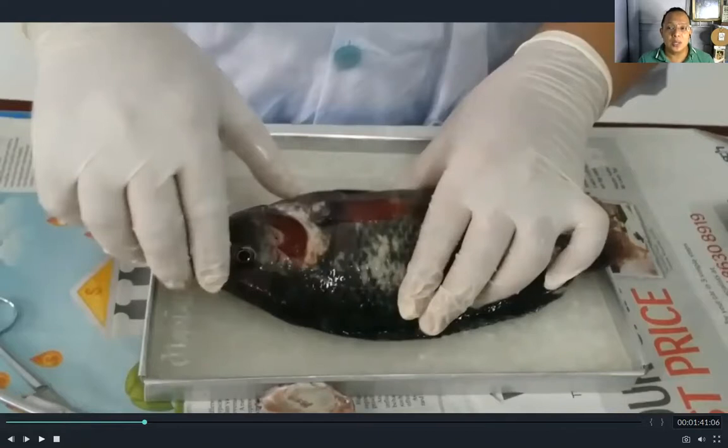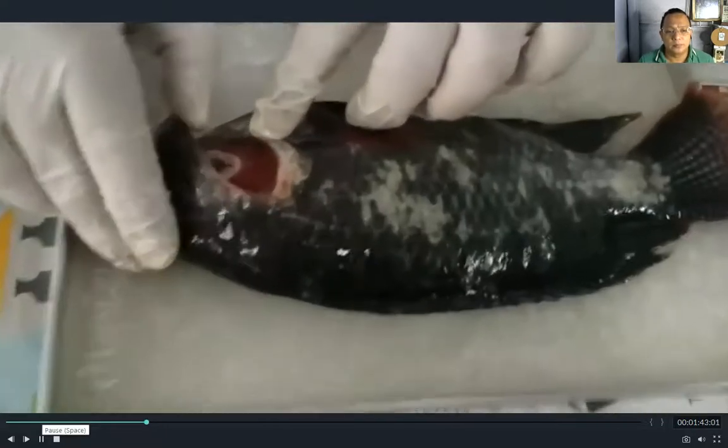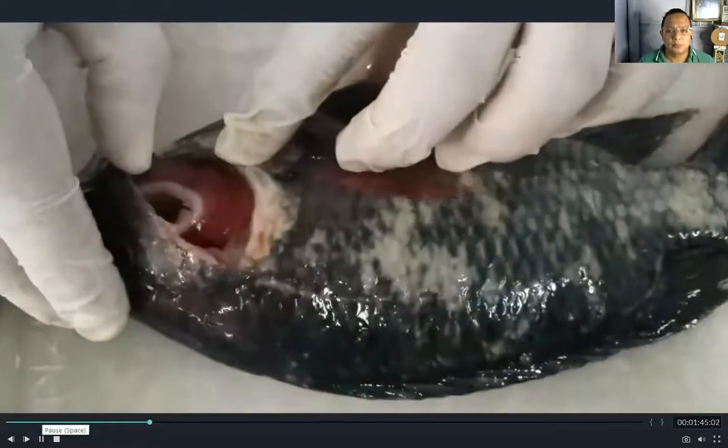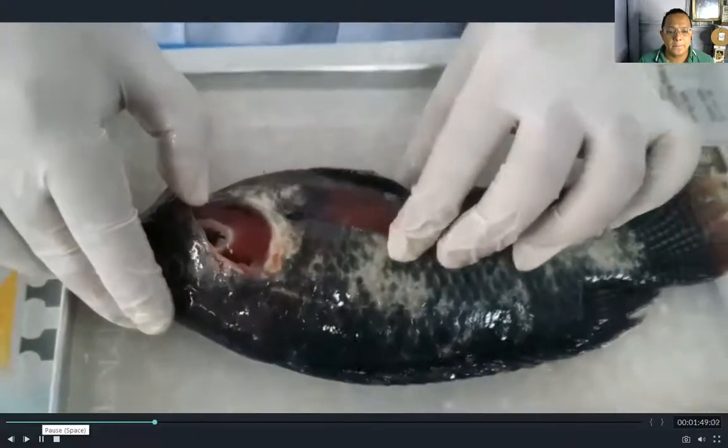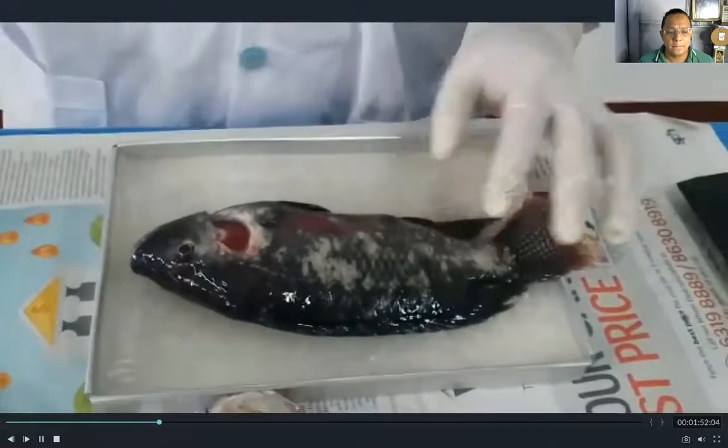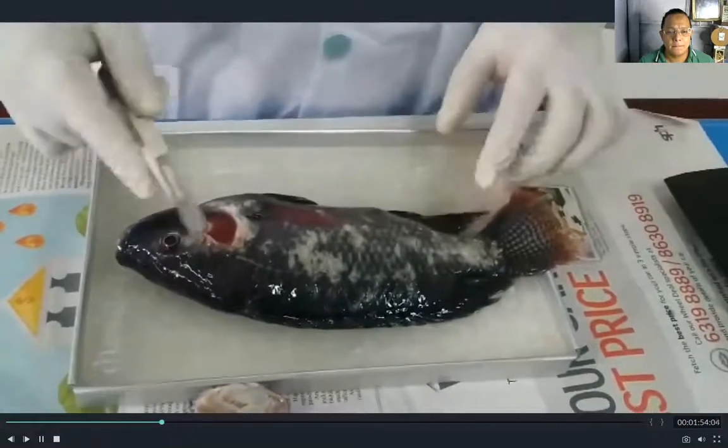Remember again to ask guidance from your older family member. The gills of the fish — take note, the gills help the fish to breathe underwater.